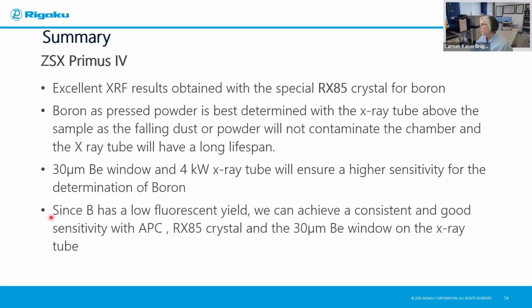So in summary, XRF is quite a nice technique to determine boron, especially with our hardware and software features.